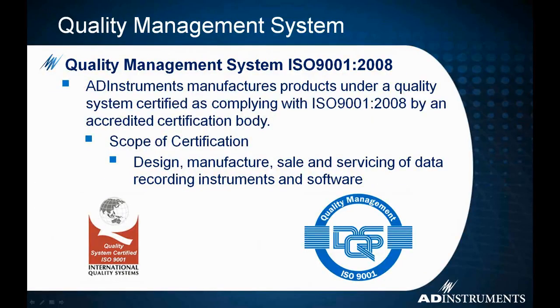Also, I have a lot of people ask me in different ways, how do I know that what's being put into the front of the PowerLab or my other AD Instruments device is accurately being displayed in the software? What I'm seeing is really what's coming into it. We've spent much time and expense getting our Quality Management System ISO 9001 certified, and basically they come in and evaluate our design, manufacturing, sale, and servicing departments to see that we're doing things appropriately according to what is laid out for other medical device manufacturers. That our testing and validation design is such that what's going in is what is being reproduced and displayed.